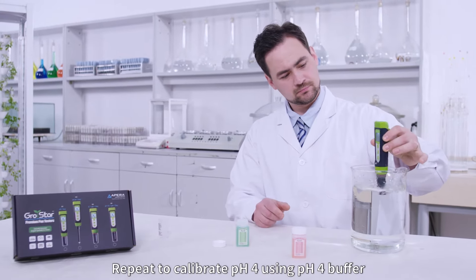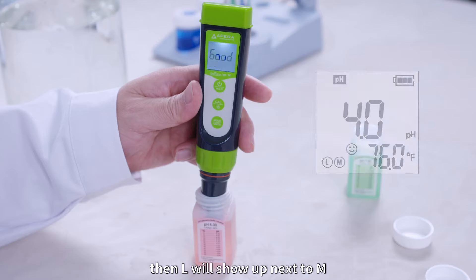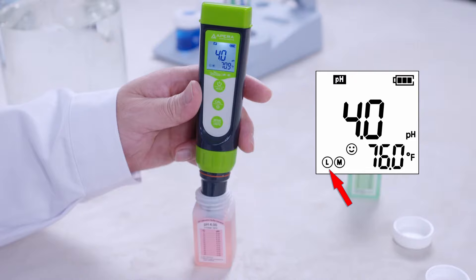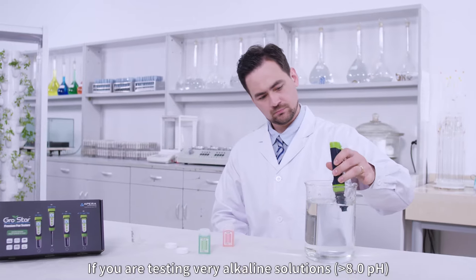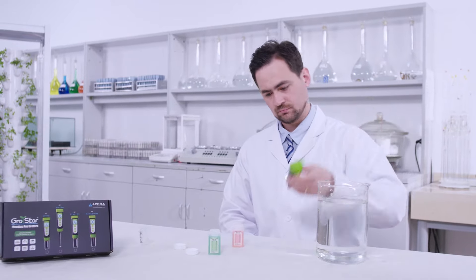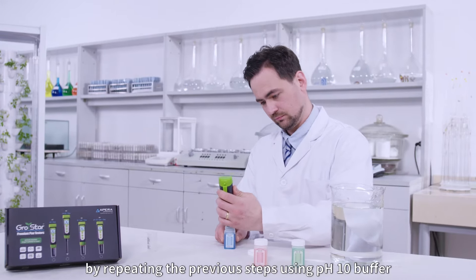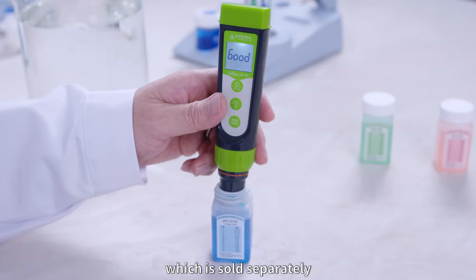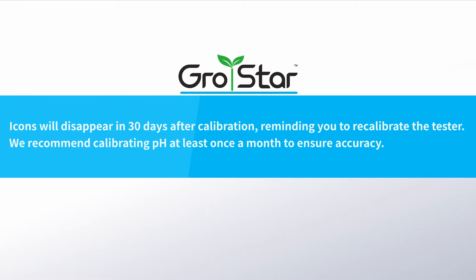Repeat to calibrate pH 4 using pH 4 buffer. Then L will show up next to M. If you are testing very alkaline solutions greater than 8.0 pH, you can continue to calibrate pH 10 by repeating the previous steps using pH 10 buffer, which is sold separately. Then H will show up to the right of M. Icons will disappear in 30 days after calibration, reminding you to recalibrate the tester.